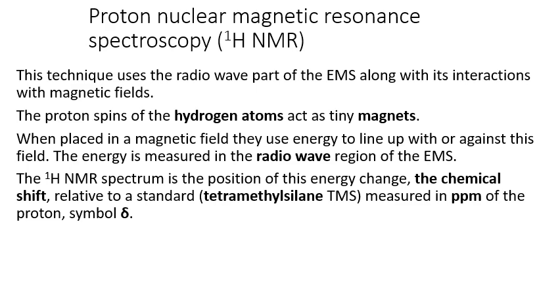The nuclei of the hydrogen atom can exist in 2 possible spin states. As such, they can behave as tiny little magnets. When there is no magnetic field, the 2 spin states have the same energy and random orientation, and when the nuclei are placed in a magnetic field, the spin states may align with the magnetic field or against it. This means that two energy levels exist. The parallel alignment of the nuclear spin with the external magnetic field is of a lower energy compared to the anti-parallel configuration, and this energy difference, delta E, corresponds to the radio wave region of the electromagnetic spectrum.